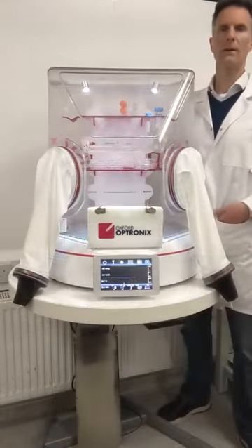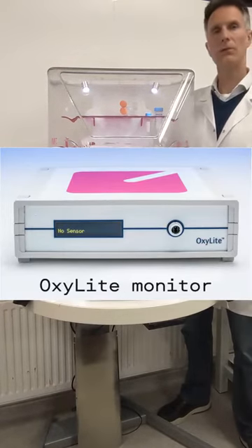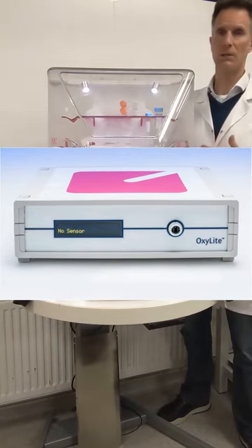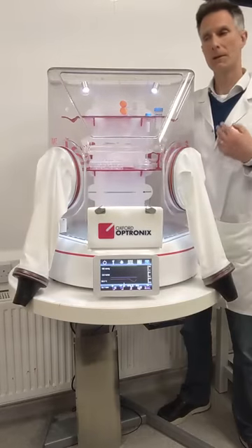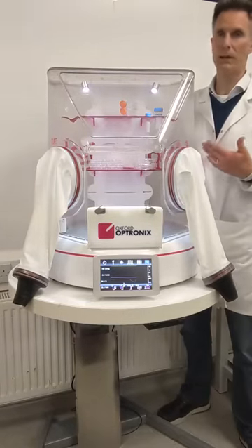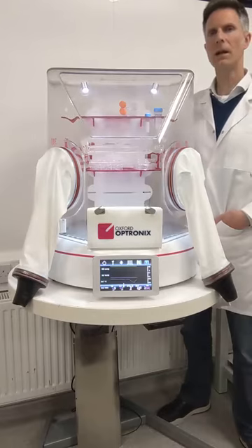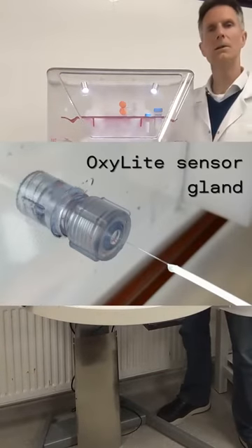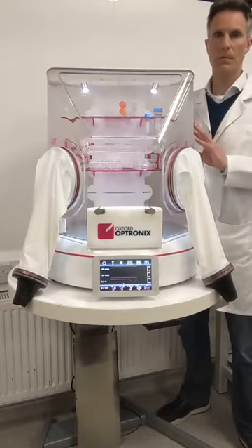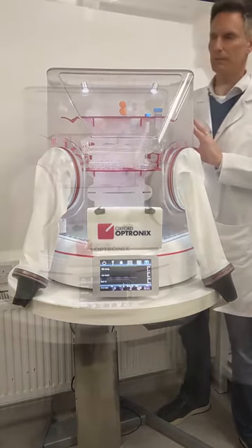A further optional add-on is our Oxylite oxygen monitor, which allows and supports the direct measurement of dissolved oxygen, not just within the environment of the chamber, but directly from cell cultures themselves or cell culture medium. The HypoxyLab features a dedicated miniature gland on its left-hand side to allow Oxylite sensors to be passed through into the chamber, all while maintaining an absolute seal.